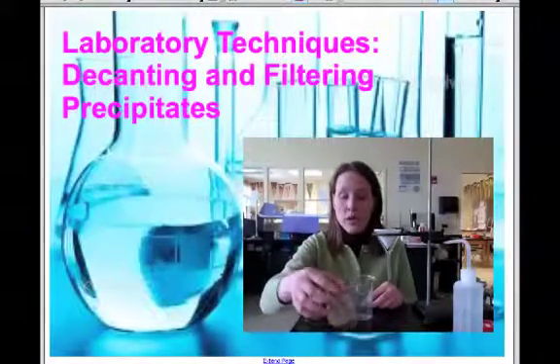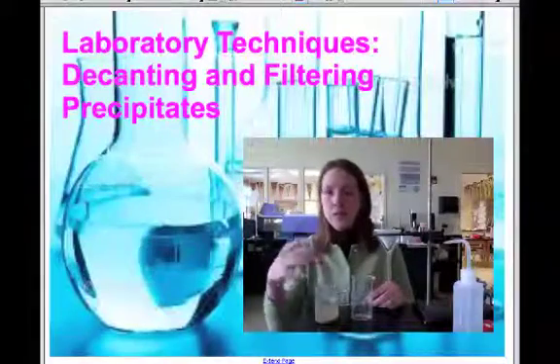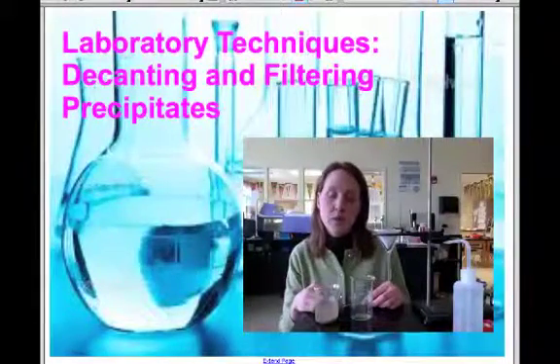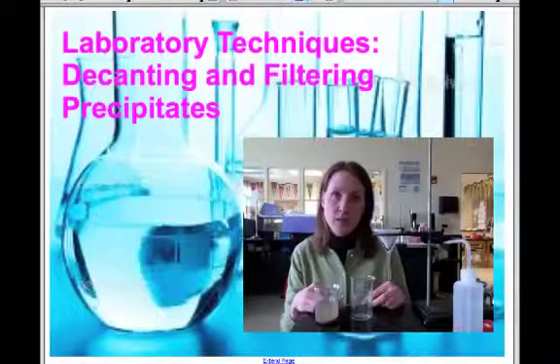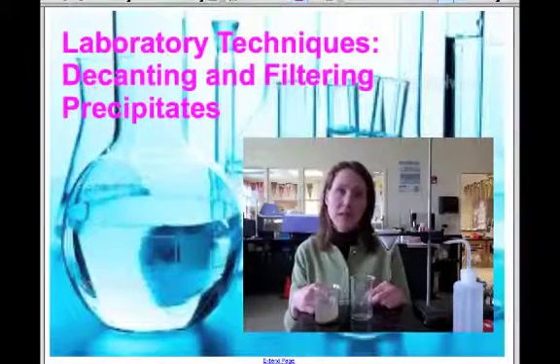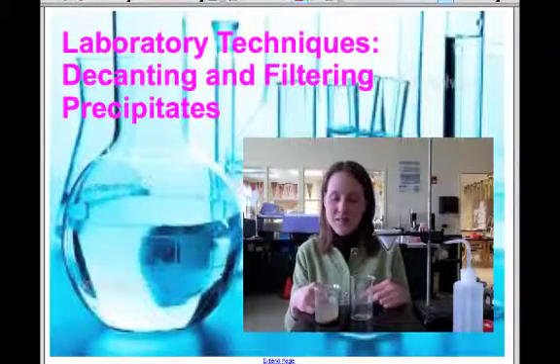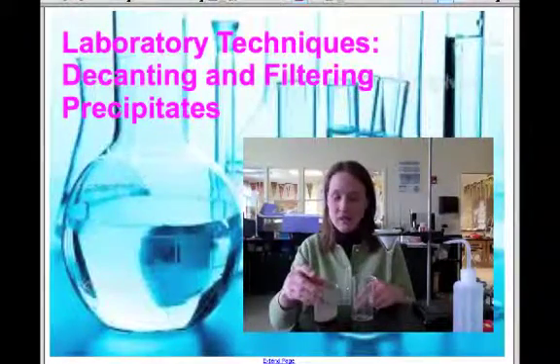Then I'm going to allow it to sit for just a few minutes. If you decant immediately after swirling, you run the risk of obviously losing a lot of your product, which in your case would not be good because you have very pretty silver crystals. So you want to save those and get all the yield that you can.